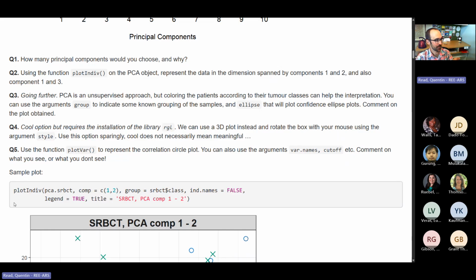So we're just going to plot the 2, because PCA axes 1 and 2 explained a lot of variation in the data. Let's plot each of our samples' data points in the first two axes of PCA space and color them by tumor type to see if they're separated out. Okay? That's what we're going to do here.